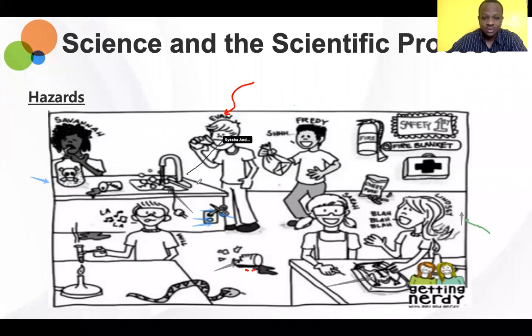So we can come up with some safety rules now. Let's remember what safety rules we spoke about last class. Right. So for Evan, what would you say? What would you say to Evan? No drinking and eating in the lab. No drinking and eating in the lab, right?